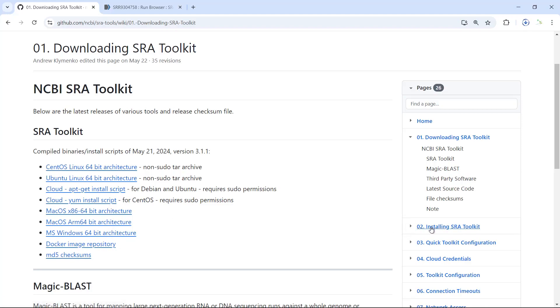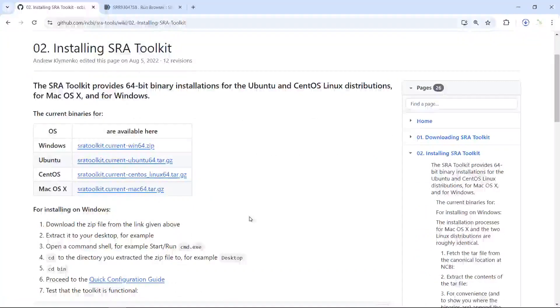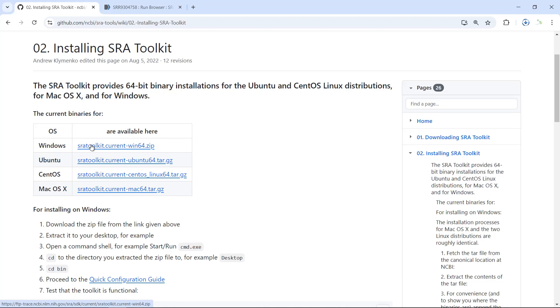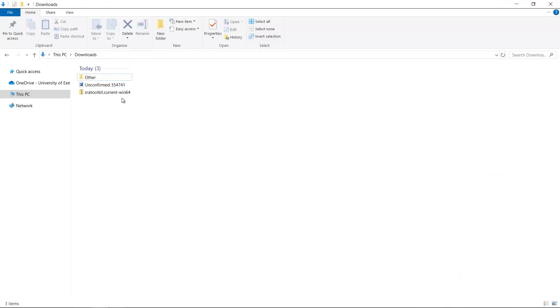The second link is for installation. It shows you how to install the SRA toolkit on your computer, with links for Windows and Mac. I'm going to download the toolkit for Windows — you can see my computer is downloading the SRA toolkit. We can go to the download folder and confirm we have the SRA toolkit for Windows.